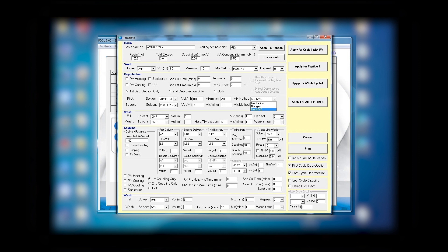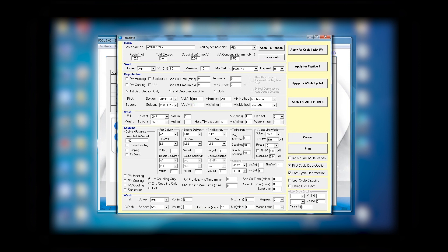The second time you have 20% piperidine, volume of 5 which you can also make 8 if you wish, and rather than 10 minutes we'll do 15 minutes, followed by mixing this time using nitrogen and mechanical.